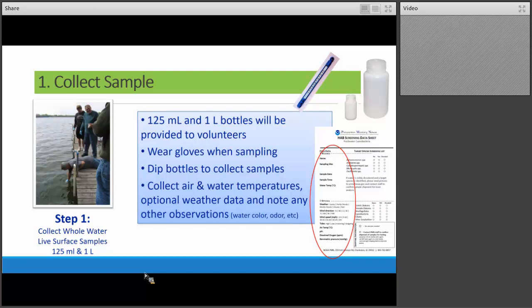But this method is completely acceptable as well. I do also recommend that if you do this method pictured, that you buy the long kitchen gloves that go up to your elbow, because that way you won't get water run down into your wrist and you can get your hand a little deeper below the surface. But we do suggest you wear gloves.